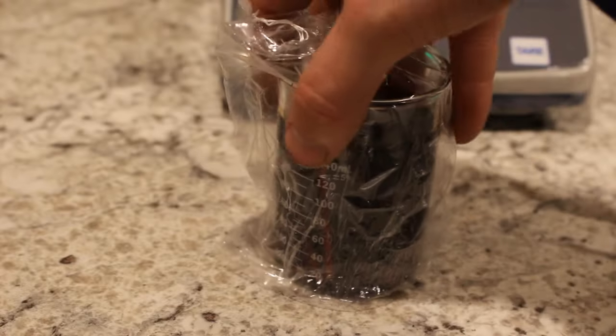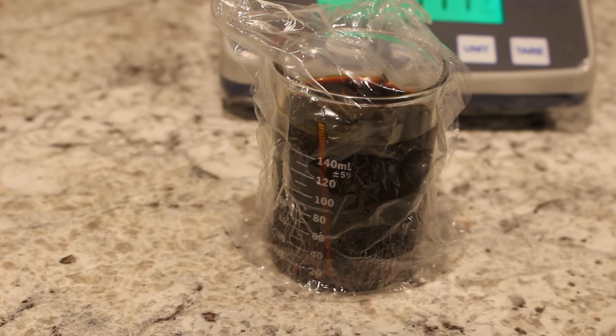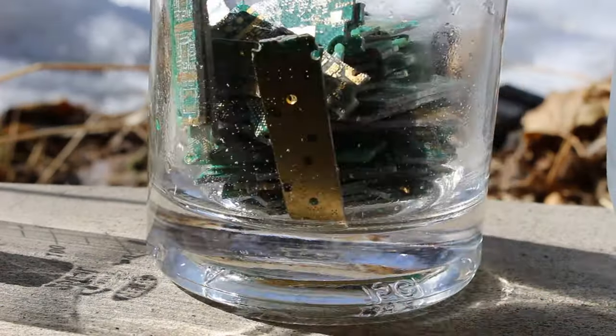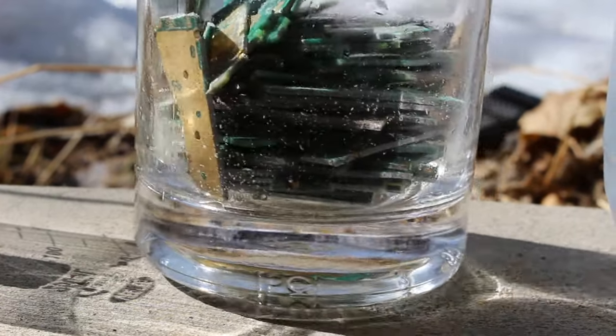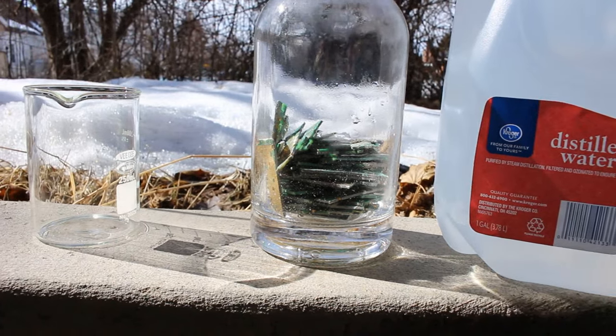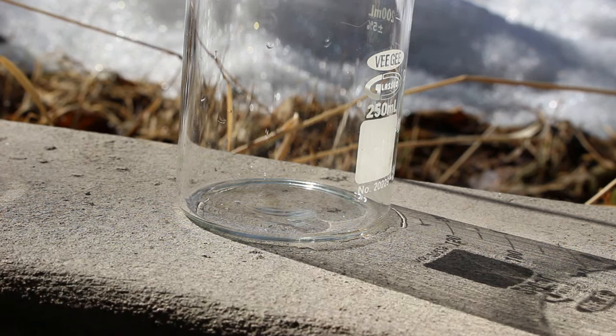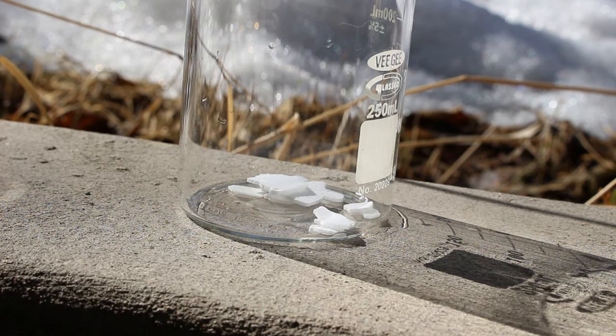You'll notice I'm actually doing this indoors because the iodine is fairly safe compared to the acid. Now you can see that I've cut up those circuit boards and put them inside of this glass bottle. I'm going to be leaching the gold off of them using cyanide. So let's make the leaching solution now. To start, I'm going to add some potassium hydroxide.